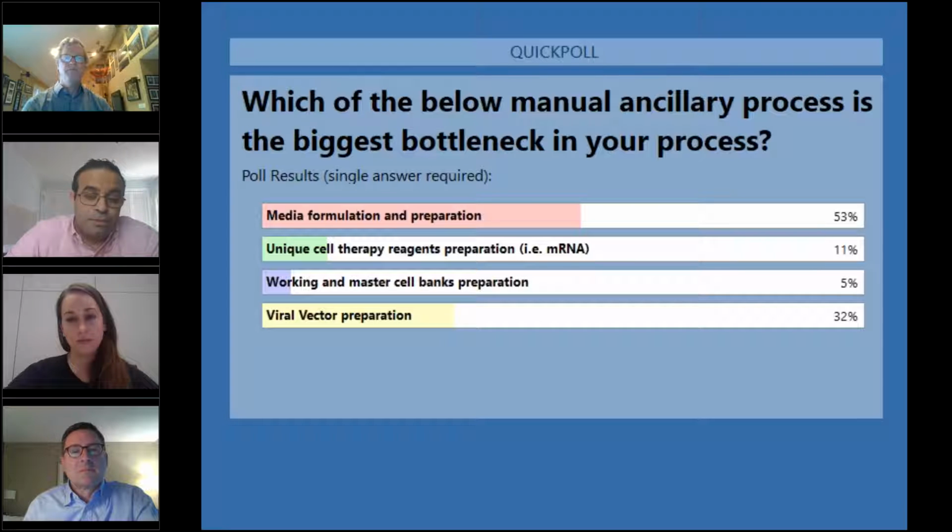So you end up thinking of ways around that, by still using that 1 ml but diluting it to 5 ml to make the system work. Vendors are catching up. They're starting to think about what is needed in this space, but we're not there yet for sure.